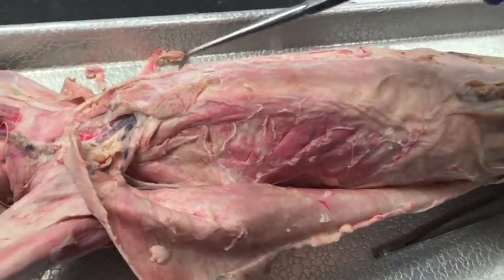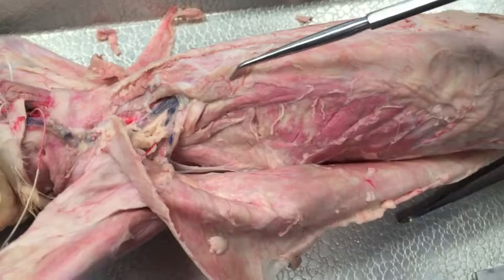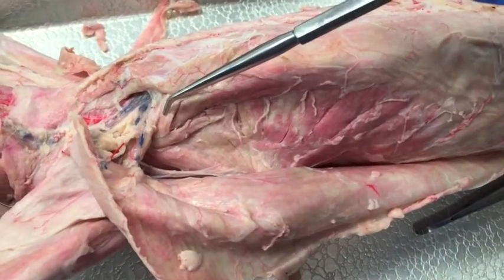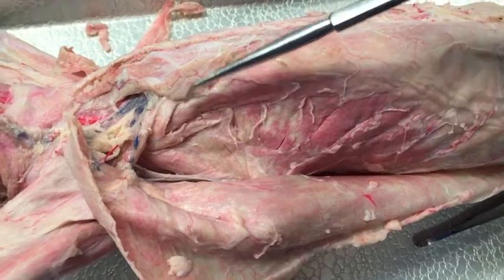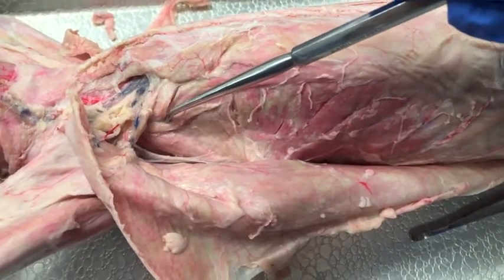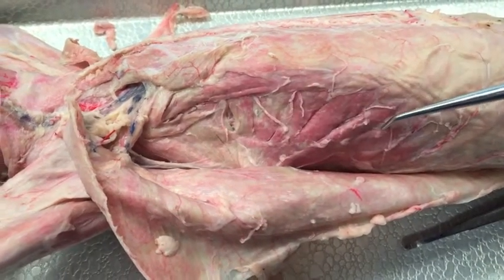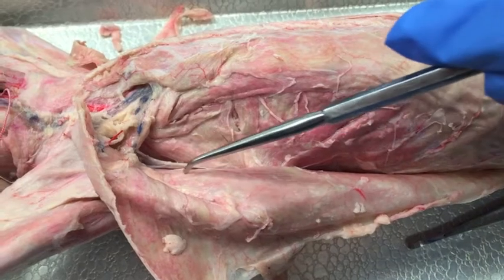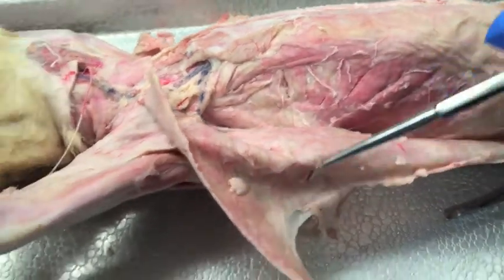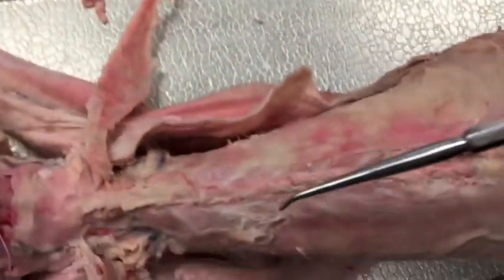This is abdominis, transverse costarum, scalenus ventralis, scalenus medius, scalenus dorsalis, serratus ventralis, teres major, latissimus dorsi, and the external intercostals.